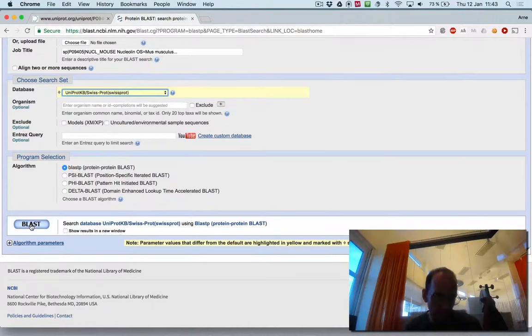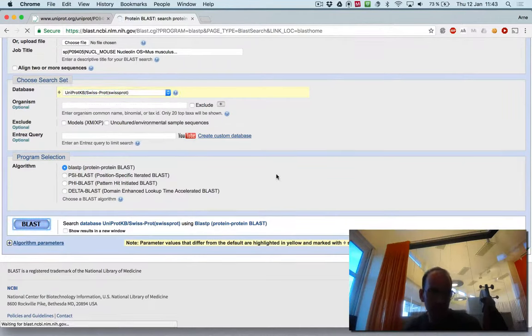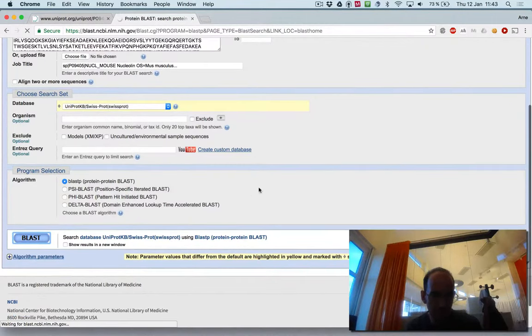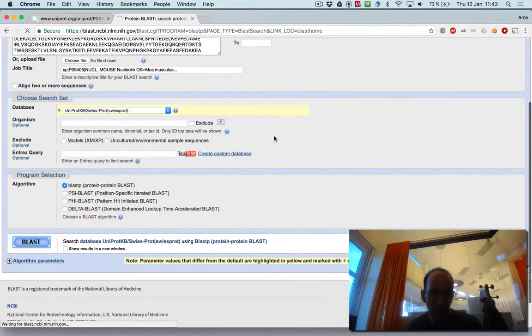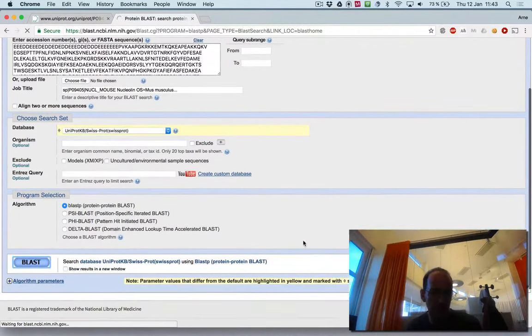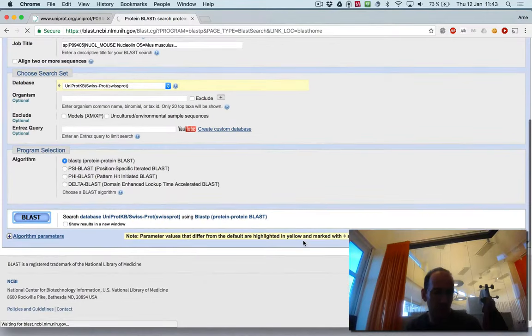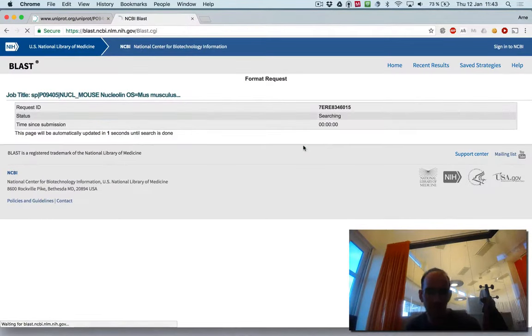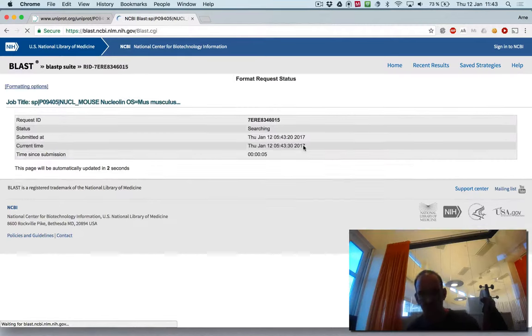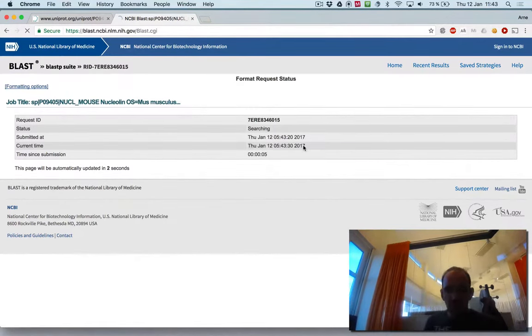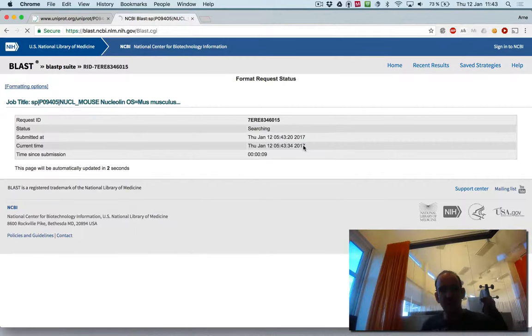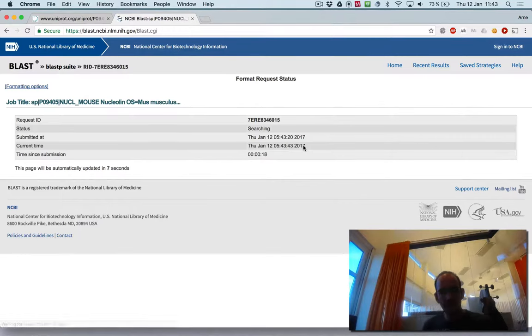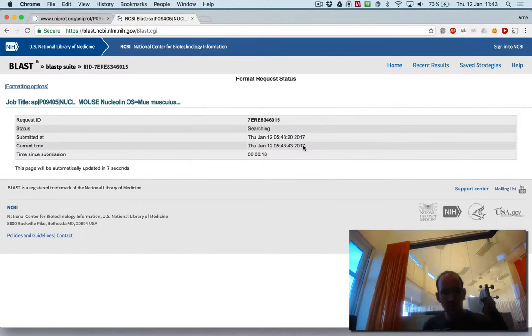So you run that. You see here that I didn't choose the standard value, I changed something there. And you see it takes some time, it's running. But because I use the SWISS-PROT database, this should be decently fast. Hopefully it's not too much time to wait.